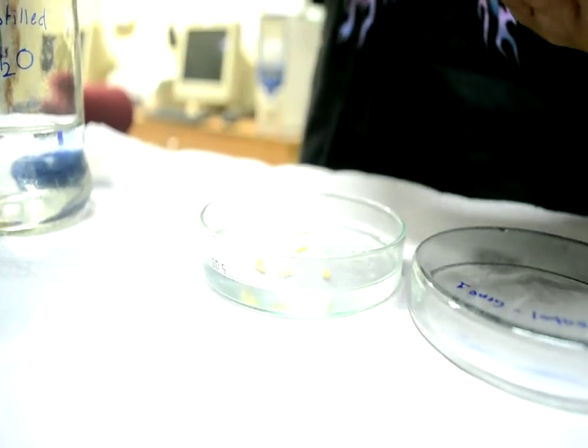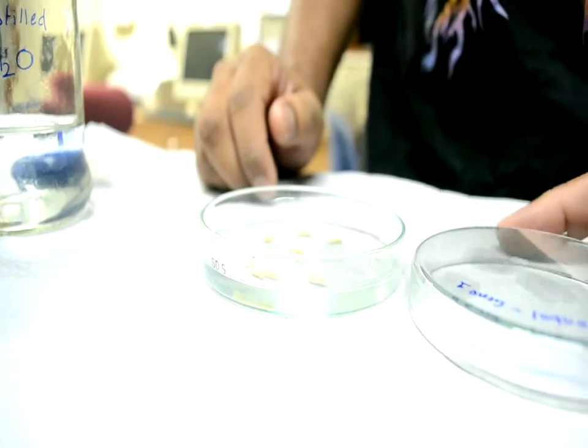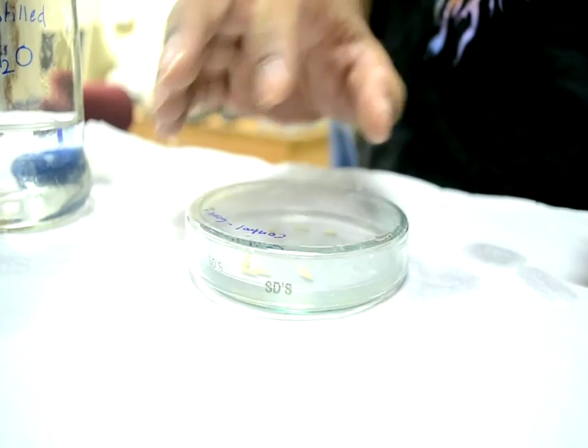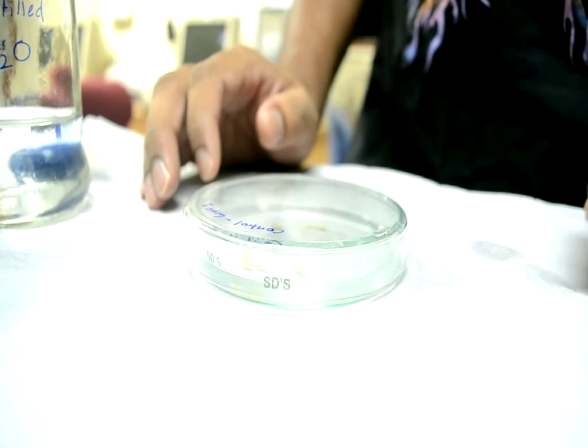It is better to use seeds without any fungal or bacterial infection in order to prevent contamination over a week or so. The lid of the petri plate is then closed to avoid evaporative loss of water and to maintain a constant volume, and the plates are placed in a room with constant temperature.